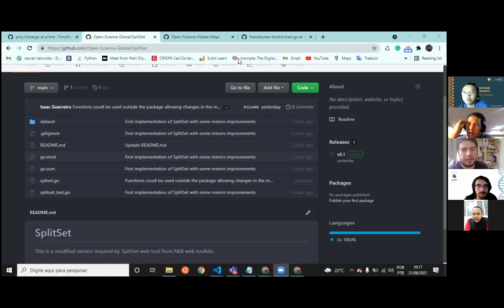Also, you might want to take a look at the bioinformatics pipelines of projects with the same kind of sequencing. Yeah, I was trying to see this, and sequencing is something interesting because everyone has the perfect tool, but I have to try to understand perfect for what. So I have to read each paper to try to see.